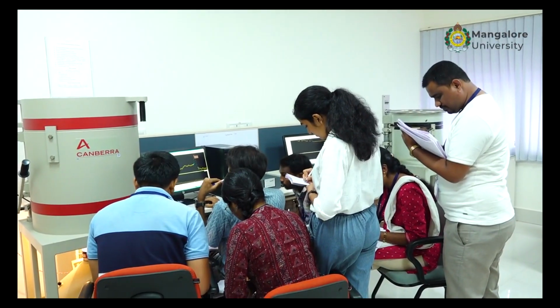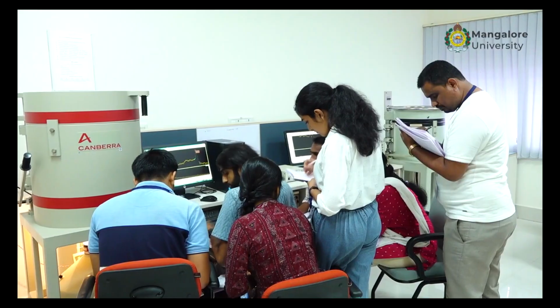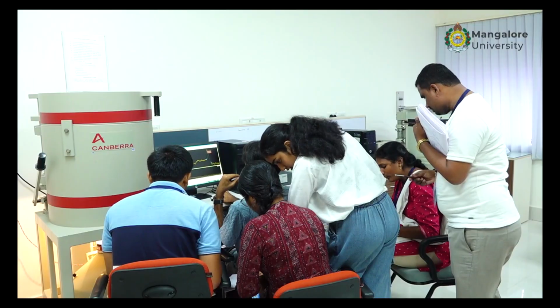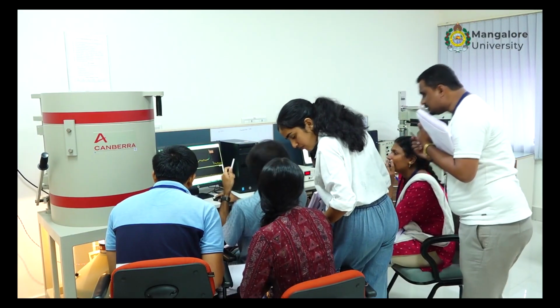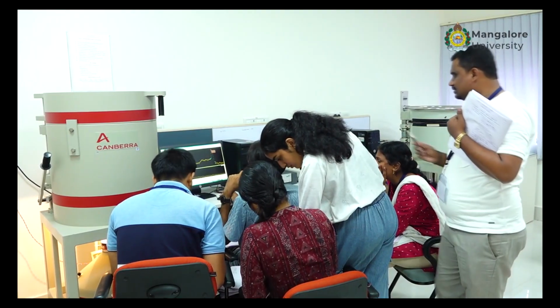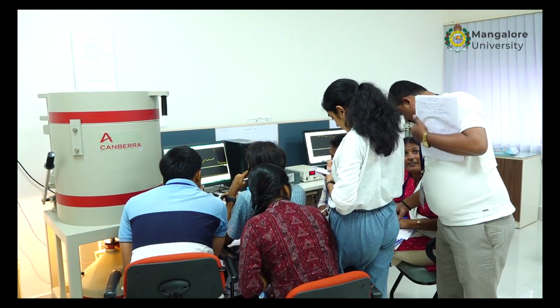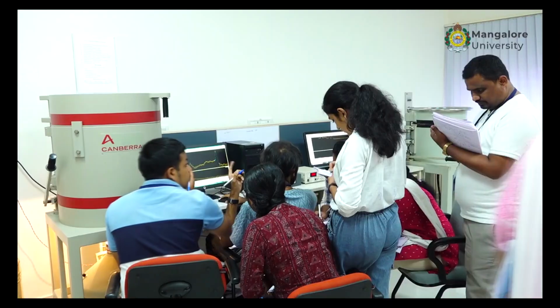21018, as you have to take that plus or minus also. Okay, note it down here. Plus or minus you have to take? 0.8. Select it, okay. Next. And after the area, that also, you note it down. Tomorrow they will talk about uncertainty calculation. At that time it will be useful.